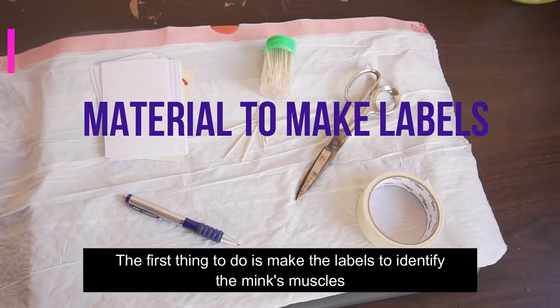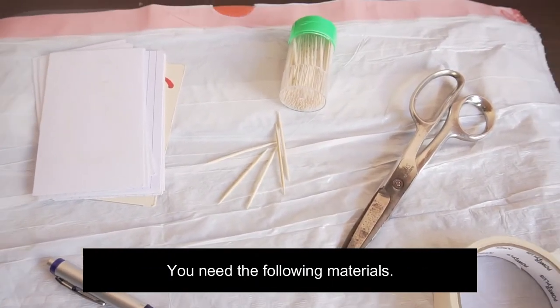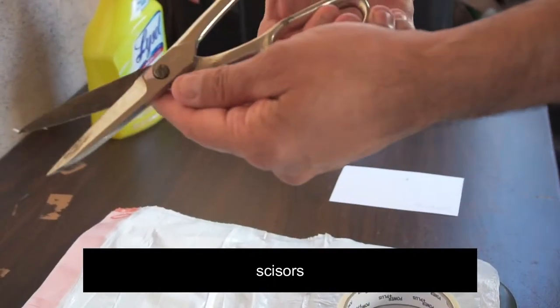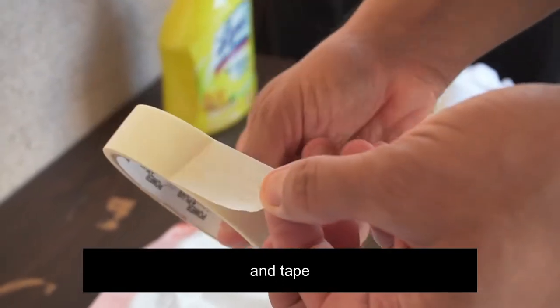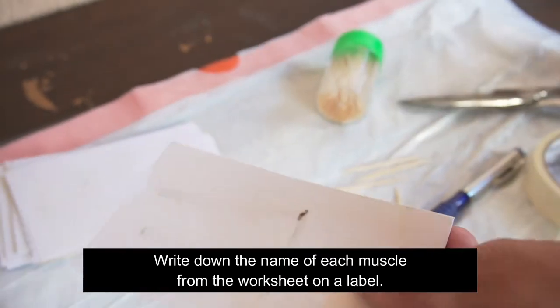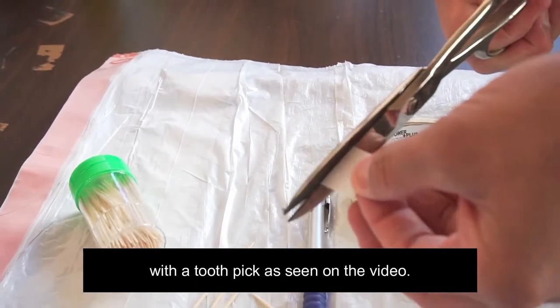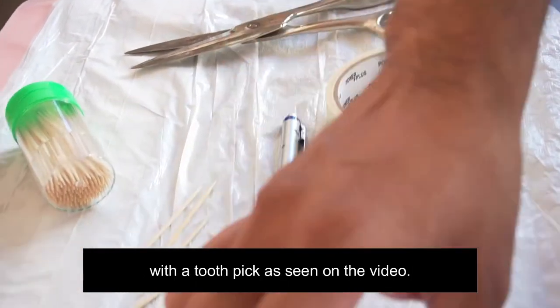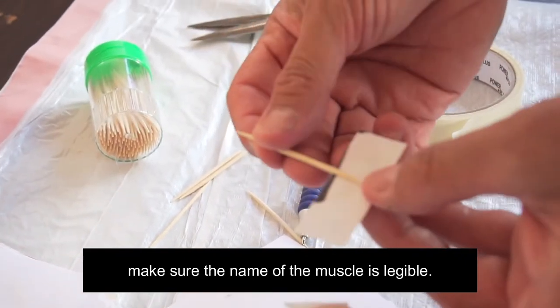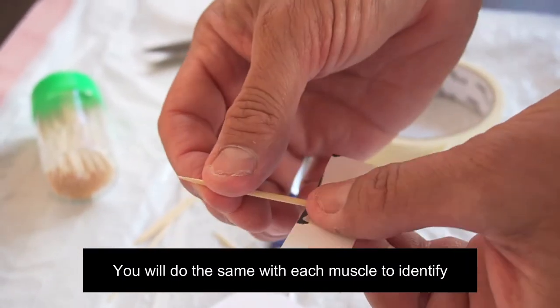The first thing to do is make the labels to identify the mink muscles. You need the following materials: index cards, toothpicks, scissors, a pen and tape. Write down the name of each muscle from the worksheet on a label. Cut a piece of tape and place it on the back of your label with a toothpick as seen on the video. Make sure the name of the muscle is legible. You will do the same with each muscle to identify.